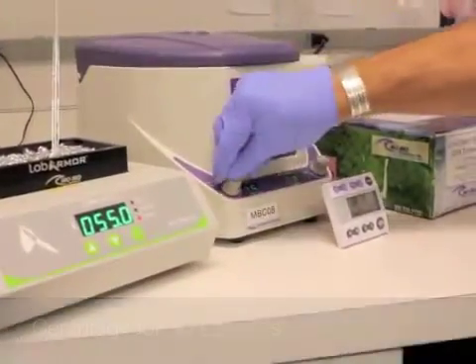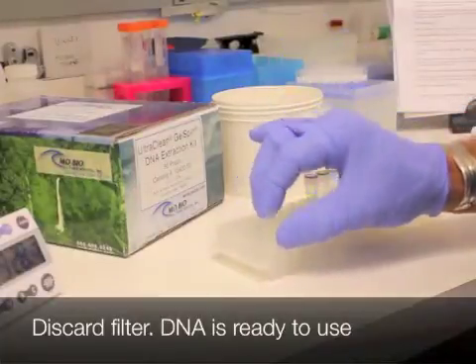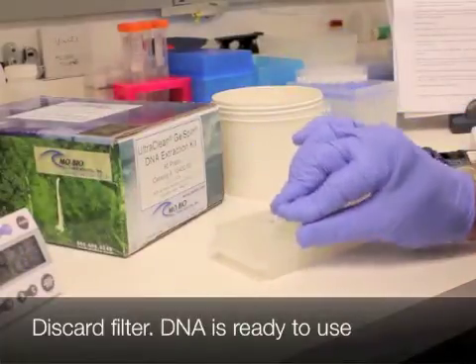Centrifuge for 30 seconds. Discard the filter basket. Your DNA is now ready for use.